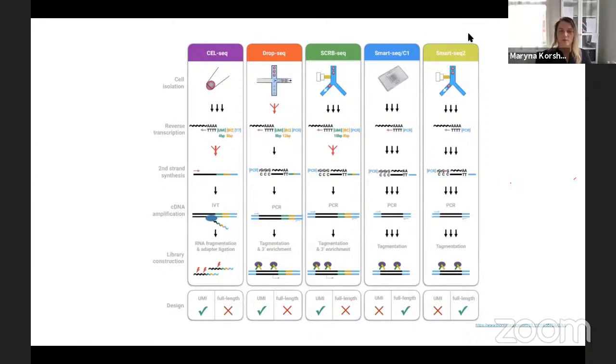So what you should know about single cell technology, and what we also will highlight in our course, is that the methods start varying from early stages. So actually from the sample preparation to the library preparation, to the sequencing technology, and so on and so forth. But to start with single cell analysis, it's easier to follow widely used approaches and already commercially developed kits. So we also will explain all of the terms and most of the approaches presented on this slide.